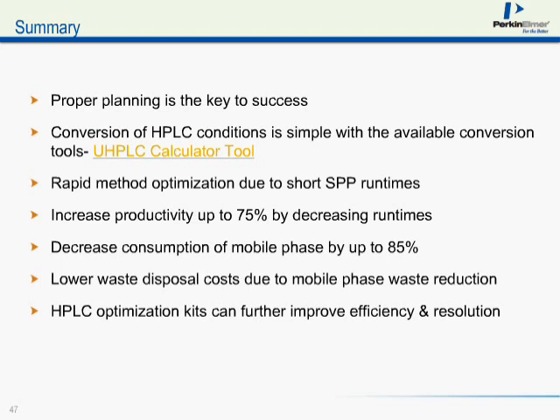Well, you don't get a loss in sensitivity because your peaks are much sharper and taller. So what happens is with the 10 millimeter path length flow cell and go into a 6 millimeter, according to Beer's law, you would assume that you would get a 40% reduction in absorbance just based on the path length.